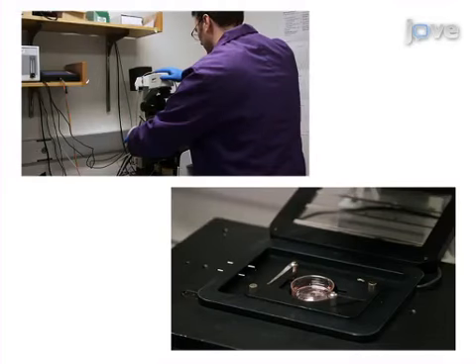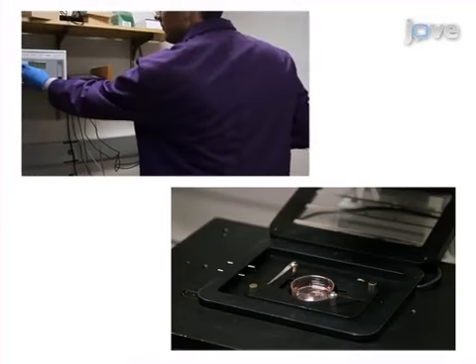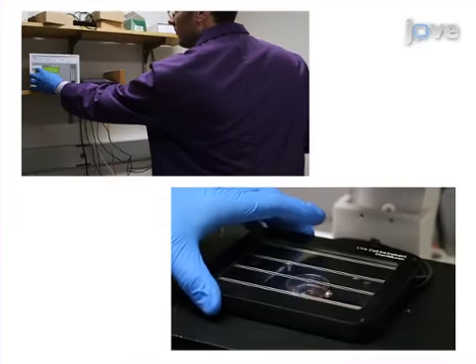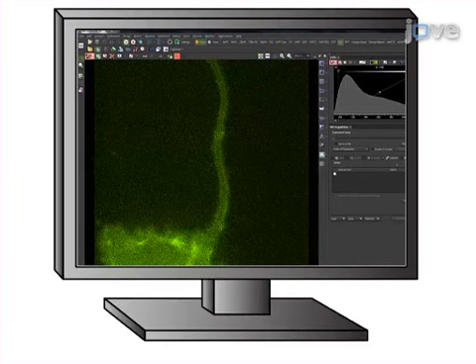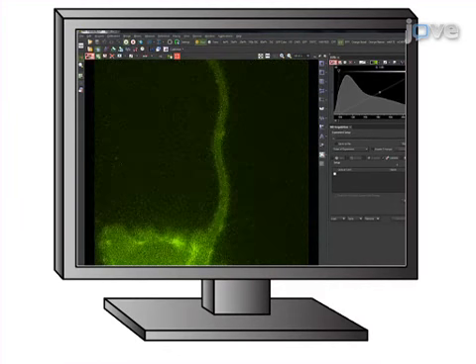This is accomplished by first establishing sample incubation at physiologically relevant temperatures on a microscope capable of fast-switching fluorescent illumination. In the second step, the parameters of the fluorescence imaging are set up to limit any cellular photo damage while acquiring reasonable data.